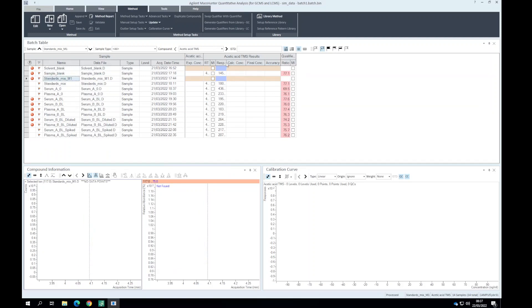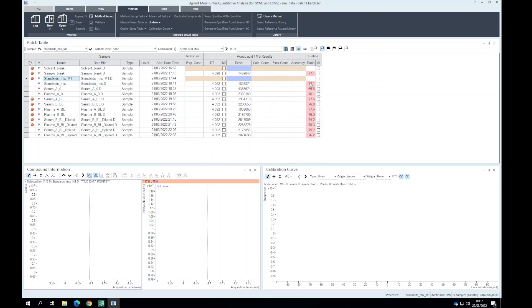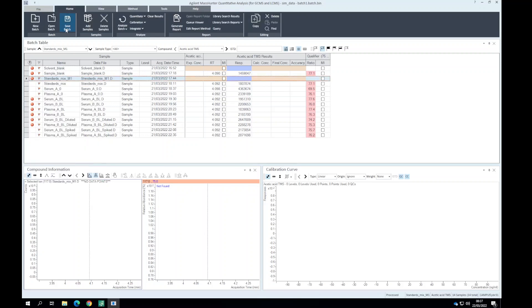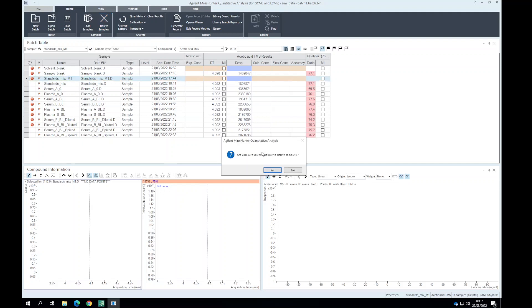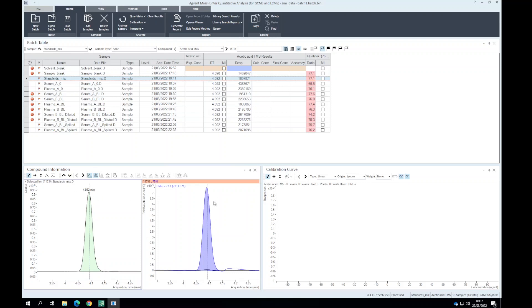We can first look at our standard to get a gauge of what the qualifier ion ratios are here. For our standards this standard was full scan data. I'm just going to remove this sample from the batch. For this standard that's our qualifier ion, that's our quantifier ion, that's our qualifier ion.